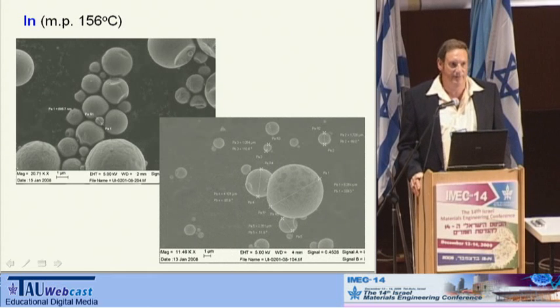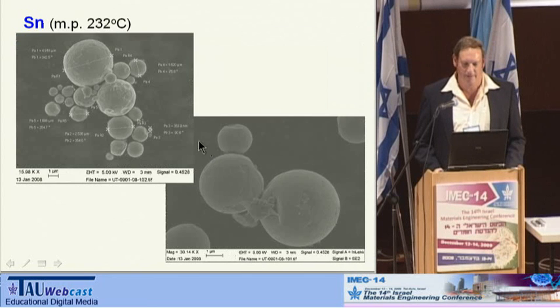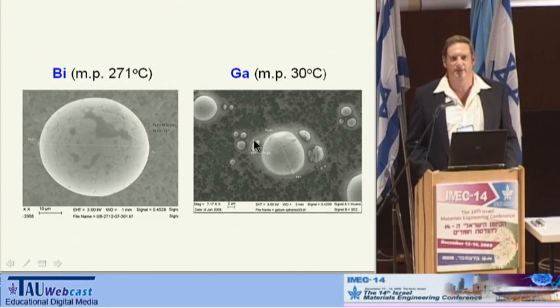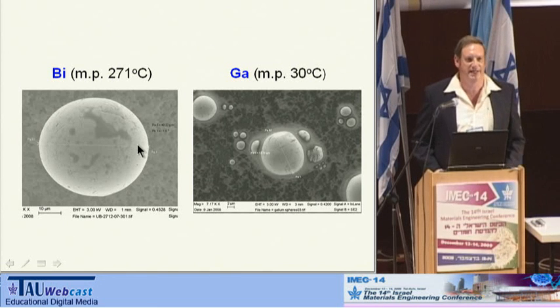We did it with five other metals, like indium. You can see here we got also spheres — this is not a picture of a water molecule, but rather three spheres of indium which are adjacent to each other. We also saw it with zinc, tin, bismuth, and gallium. With gallium, which has an extremely low melting point, you can see that it starts to melt already under the beam of the electron microscope. Some of the pictures might remind people of planets, although this line is just an aid to measure the diameter of the sphere.